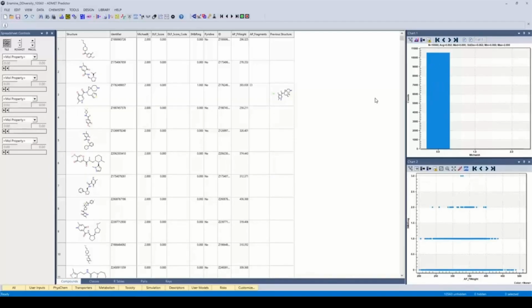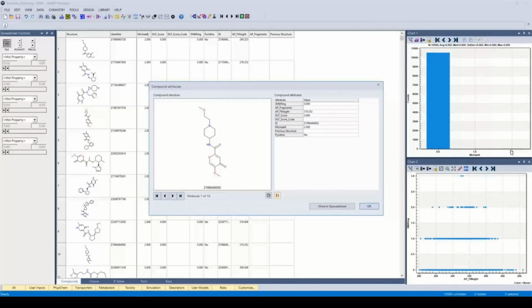Sometimes if the number of compounds is really low, it can be difficult to select the corresponding histogram bar. I was able to do it here. Otherwise, you can just select the compound and hit that arrow to scale up the selected set.